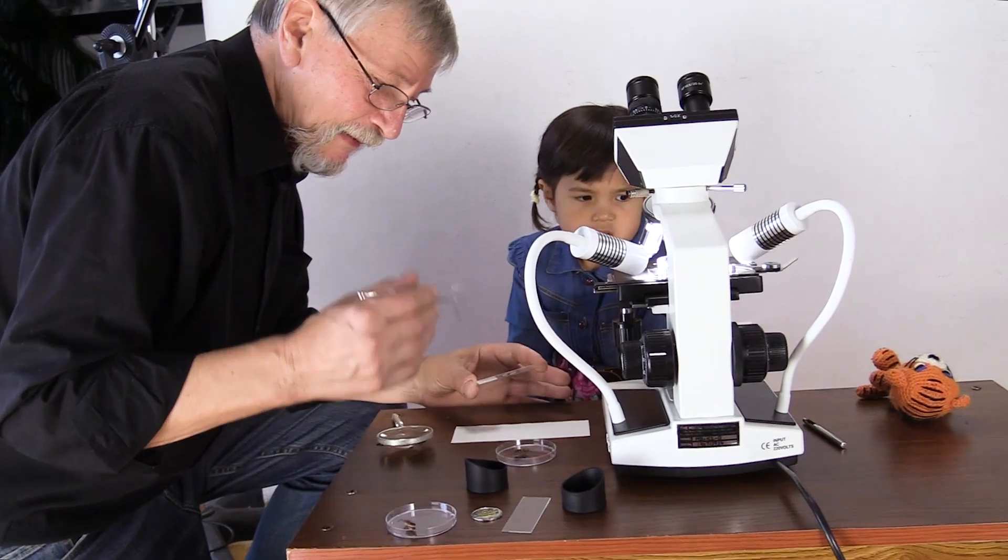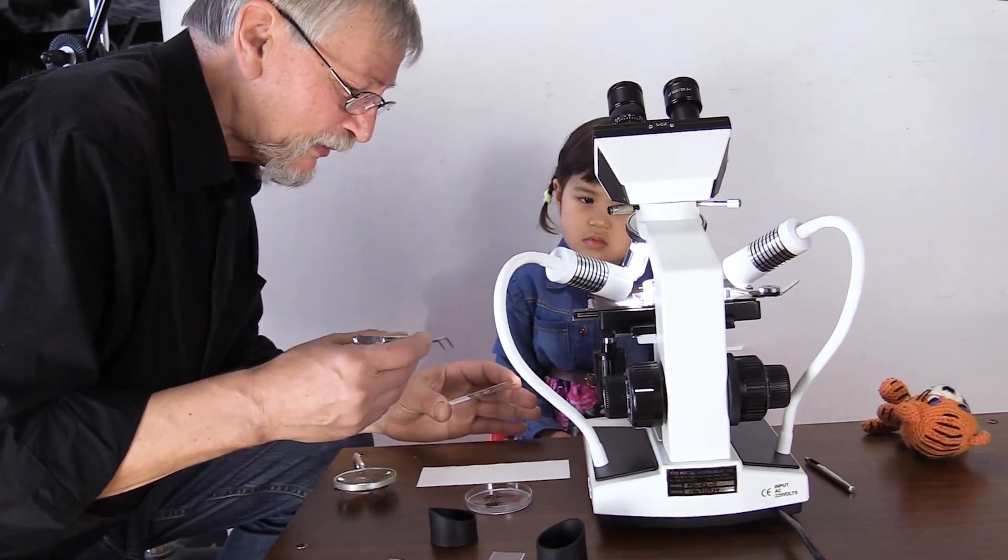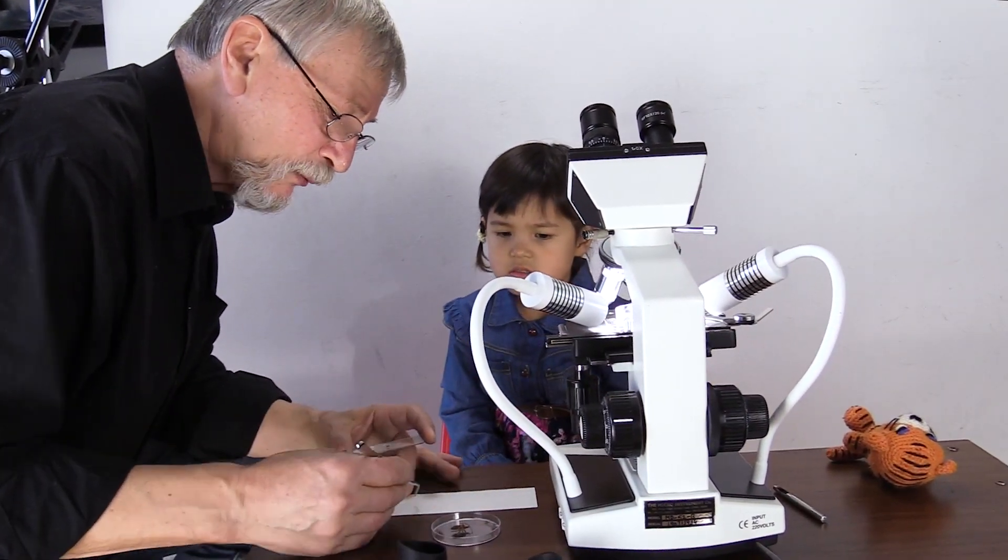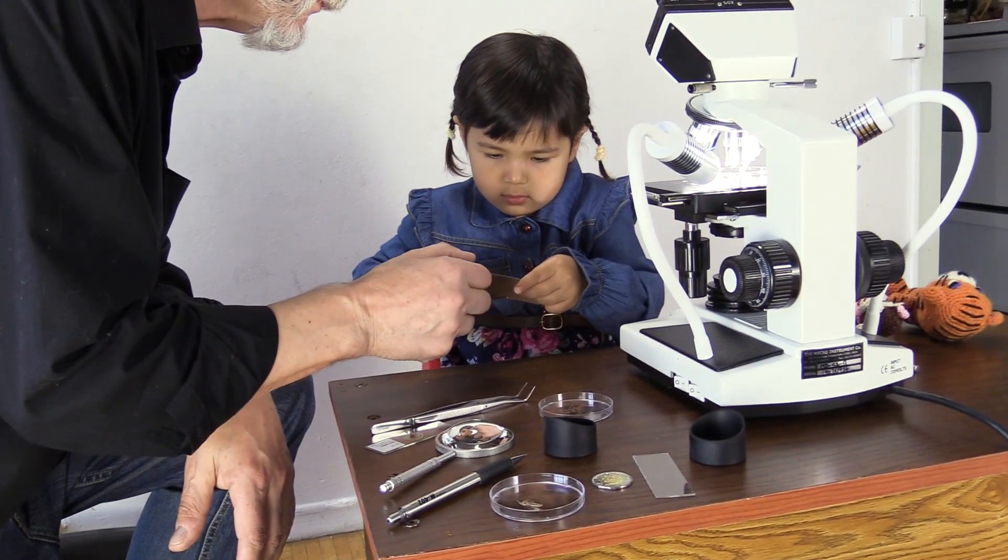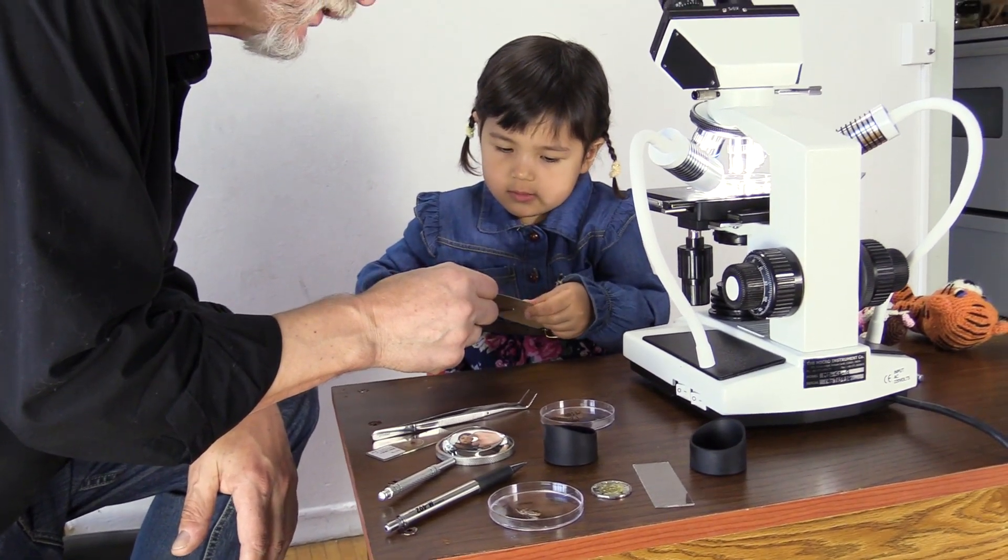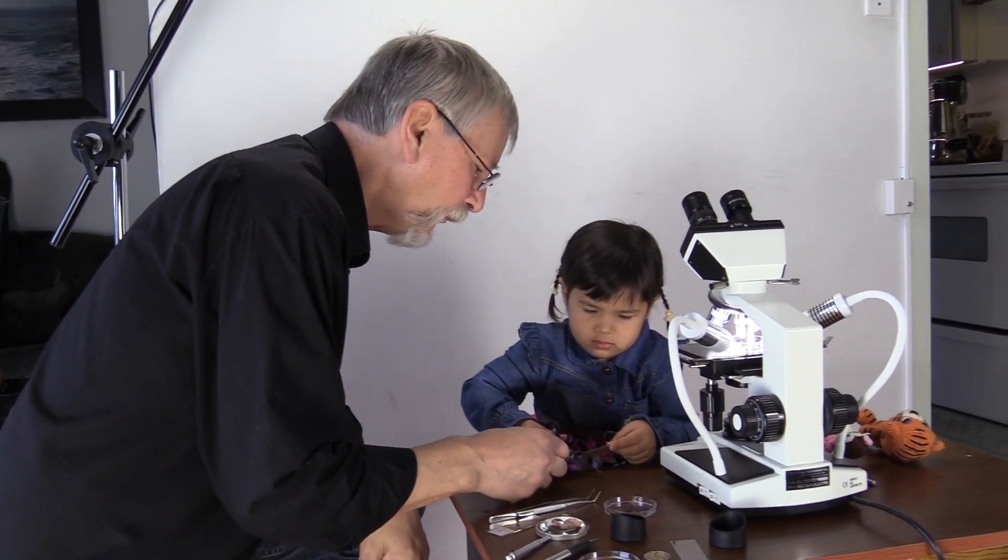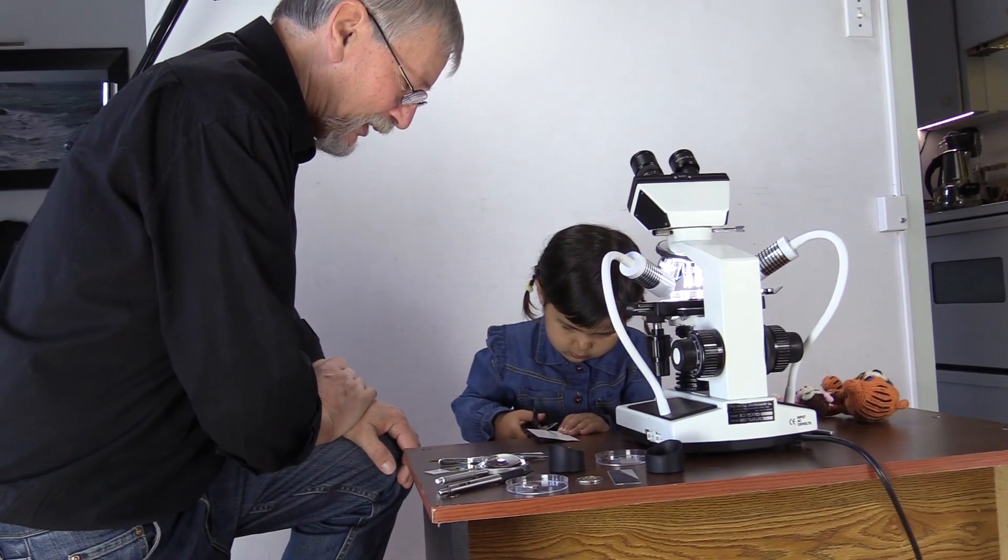You need slides to view objects put on the stage. Of course, it is possible to use slides prepared in a lab. However, for small kids homemade slides are the better solution, because they can make them themselves, with your help.